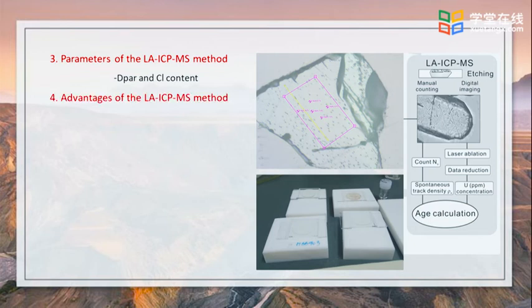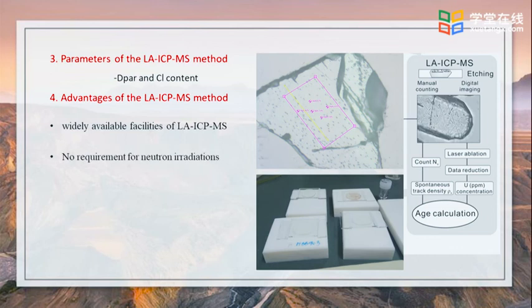The LA-ICP MS method has advantages compared to the EDM. LA-ICP MS facilities are now becoming widely available, and this mode of analysis no longer requires neutron irradiation and the long delays in sample processing.